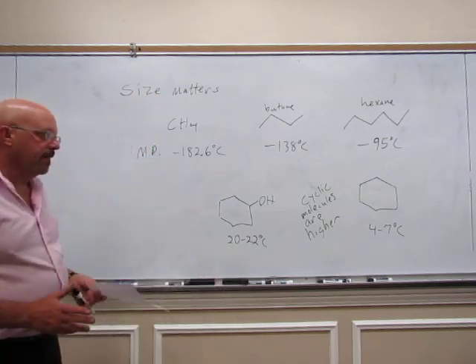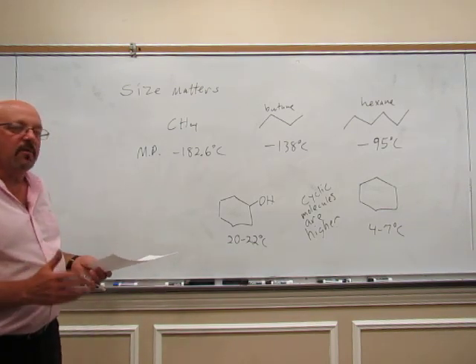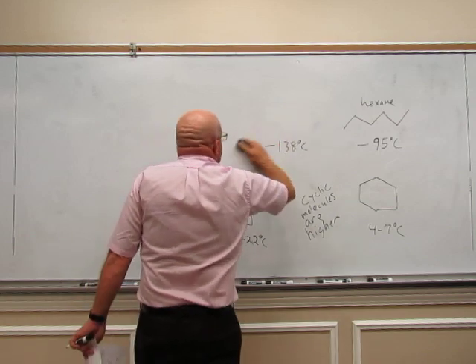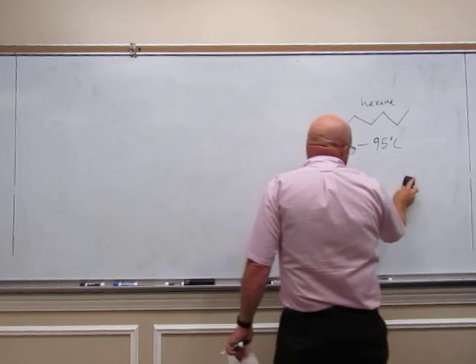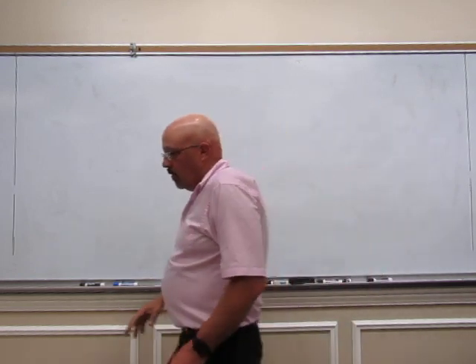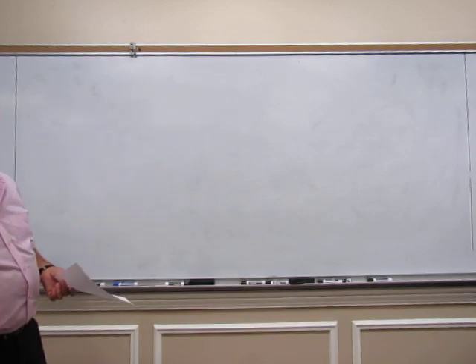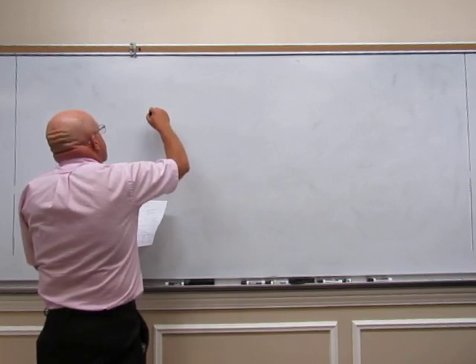So far, everything that I've talked about here is exactly the same as what we talked about when we did boiling points. There is a difference. All these things mattered on both boiling points and melting points. Size matters, ring matters, all that matters. This is the difference.